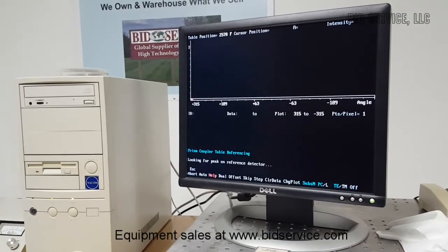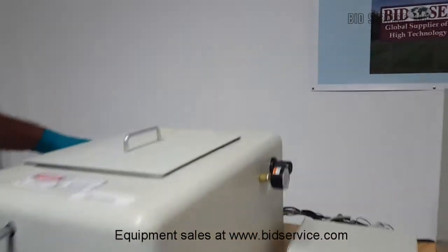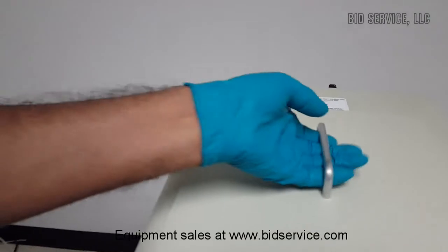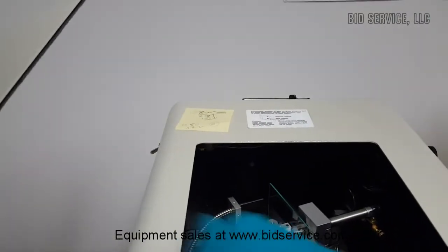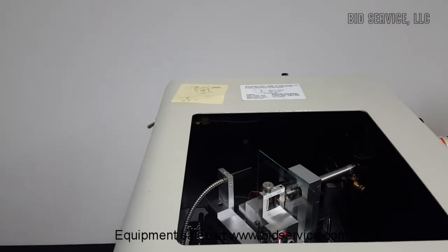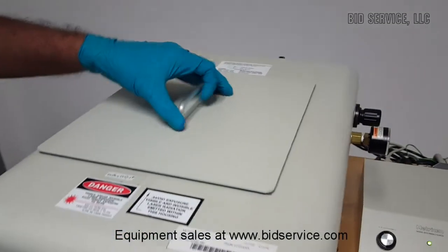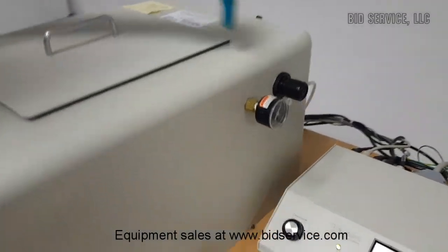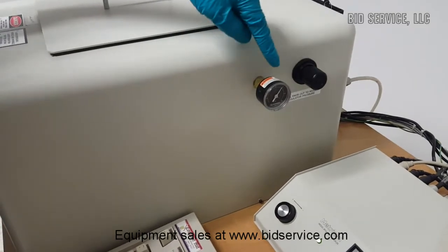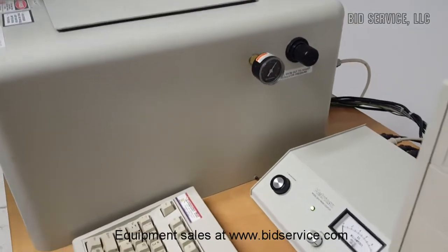So there is a pneumatic switch on the left hand side of the unit. This pneumatic switch actually helps the sample to be held against the prism pneumatically using this cylinder here. Now the pressure on the cylinder can be adjusted using this regulator, and the gauge also gives the indication of the pressure, which should be about 35 to 40 psi.